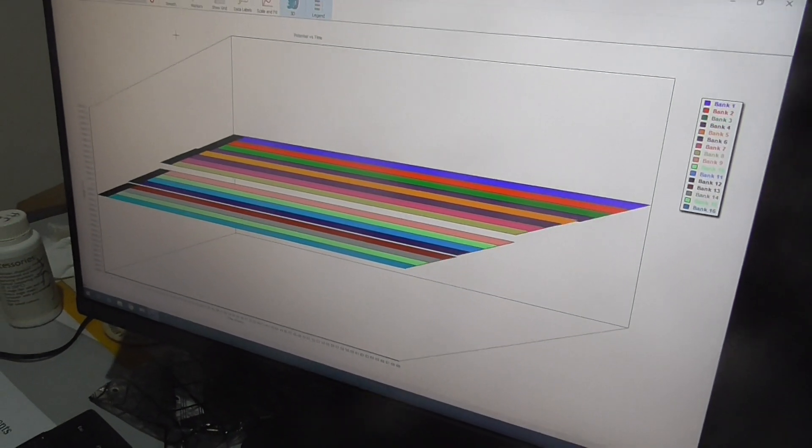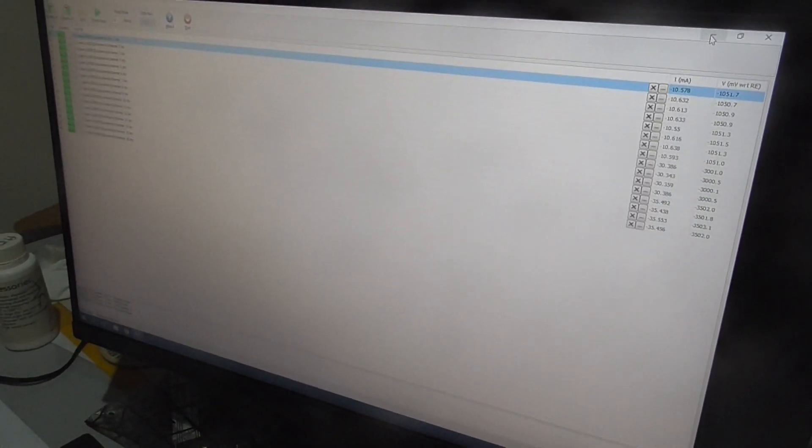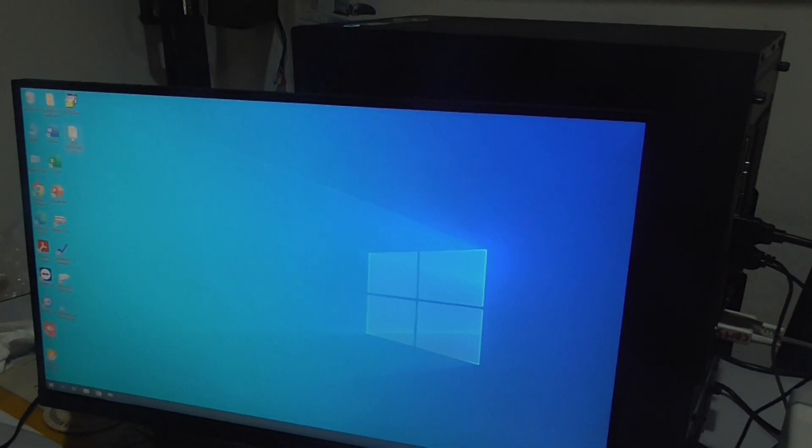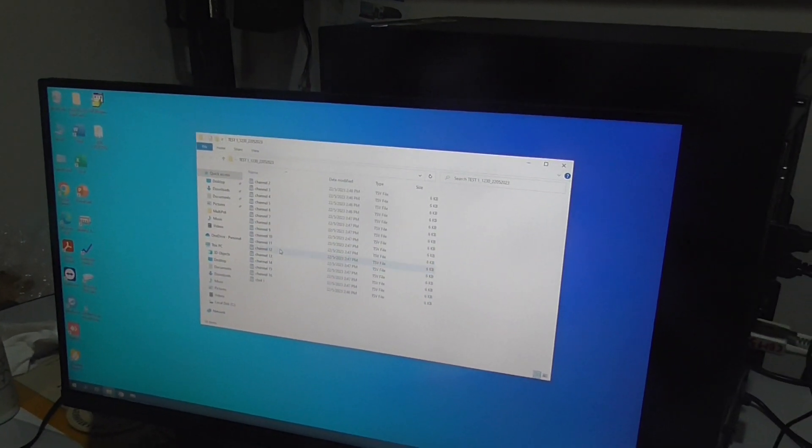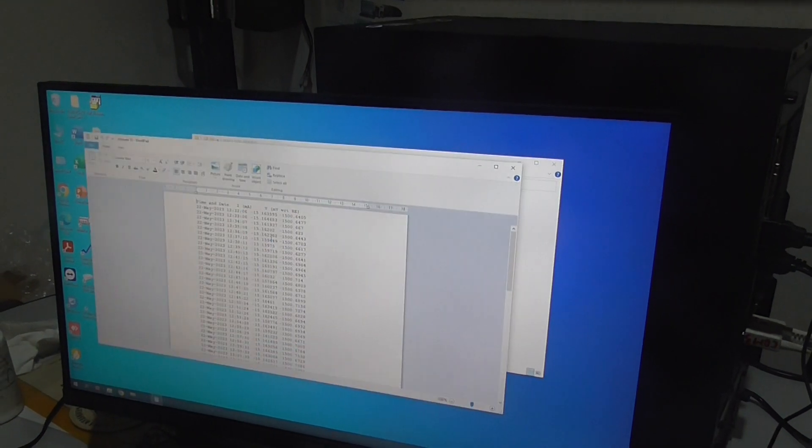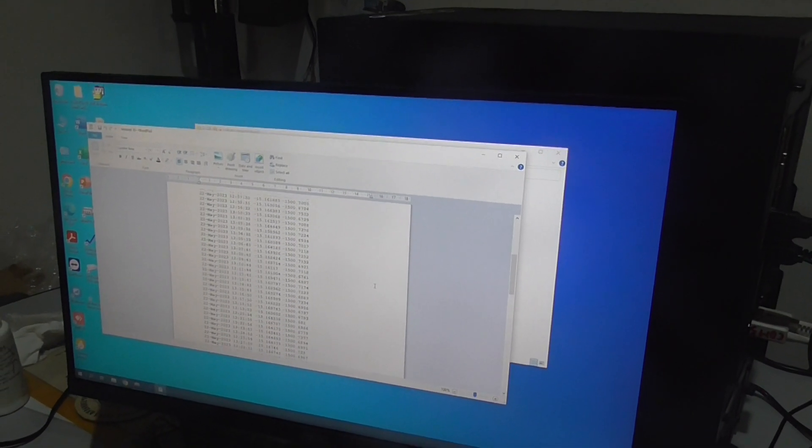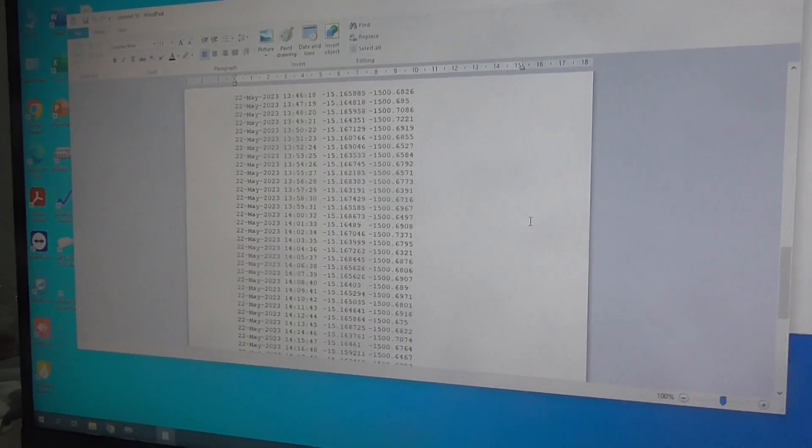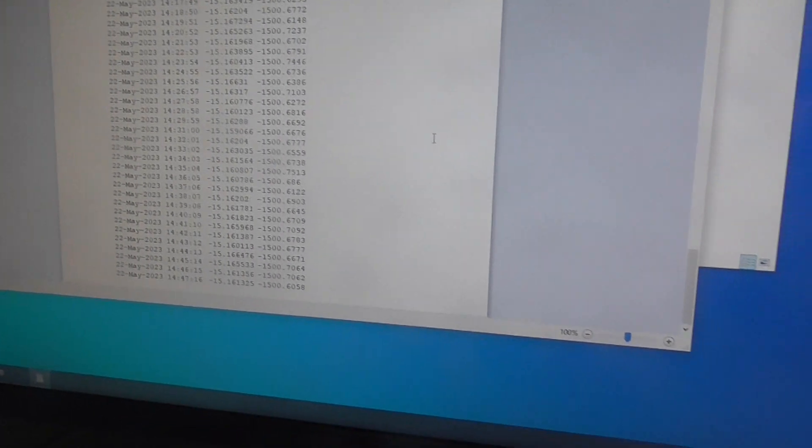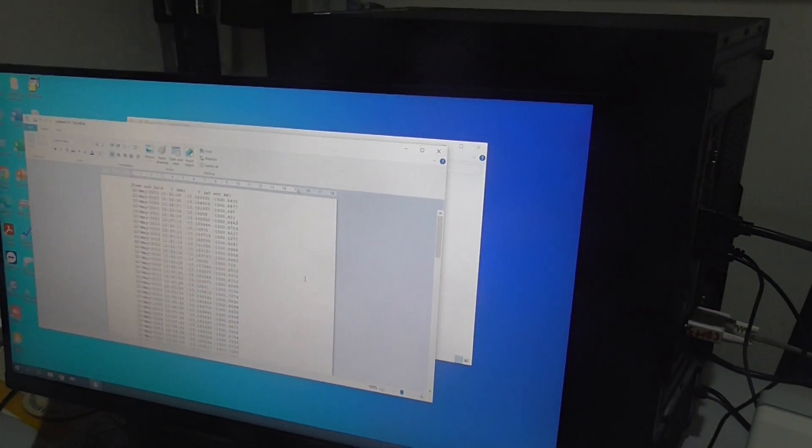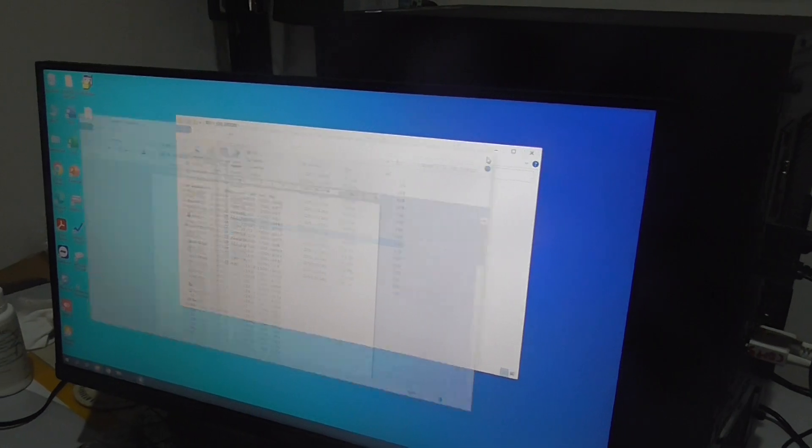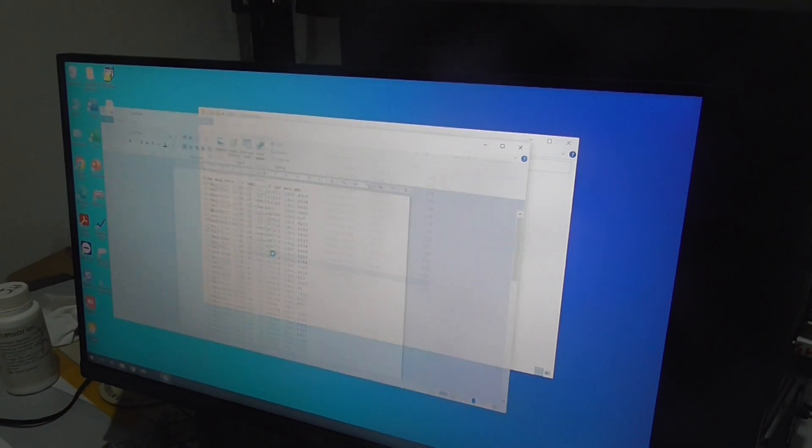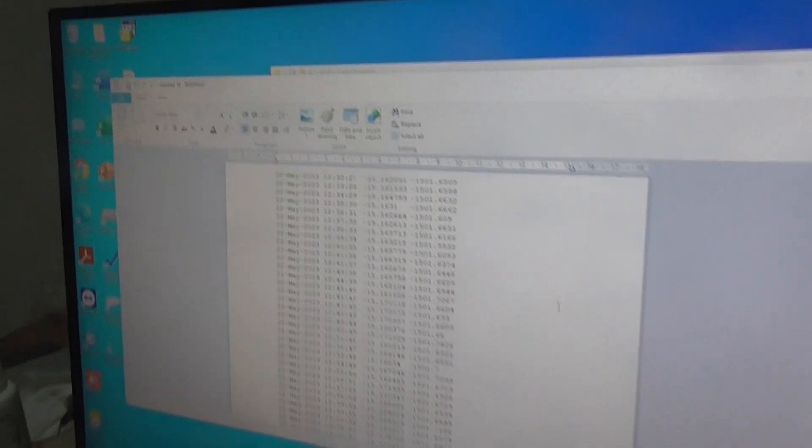They have data in the file. Let's say you want to see channel 10, you have all the raw data here and you can print it. If you want to have channel 16, this is channel 16.